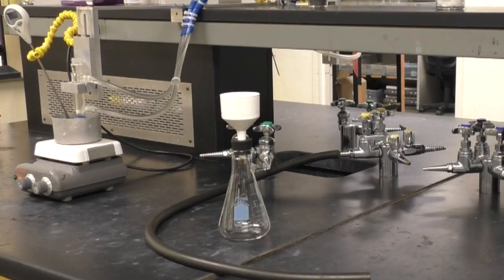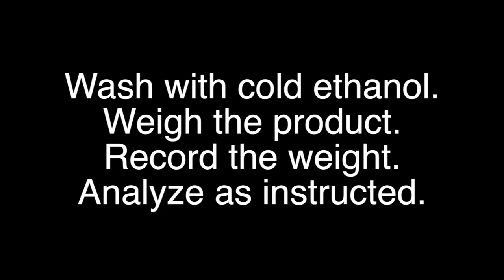Collect the crystals by suction filtration. Wash the crystals with the ice-cold 95% ethanol. Weigh your product. Record the weight and further analyze the di-tert butyl biphenyl as instructed.